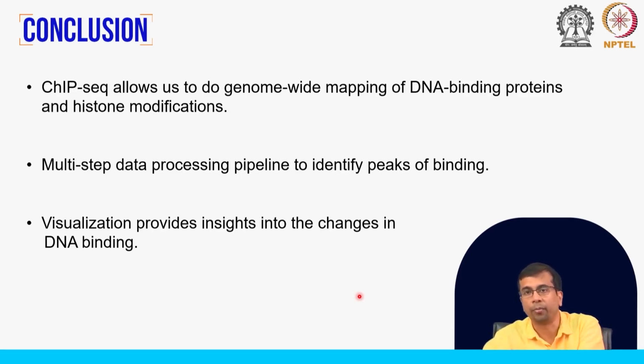Again, this data processing pipeline is also critical, and there are several points that we will be discussing in the hands on part, and this is something that we do to actually identify the peaks of binding. The final goal is to identify these peaks, where the DNA binding proteins are bound or the histone modifications have taken place.